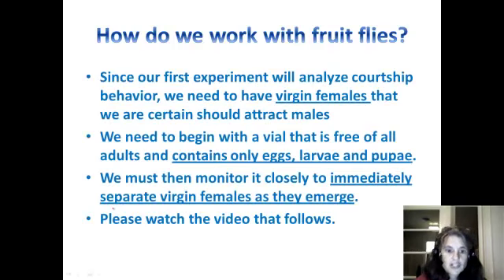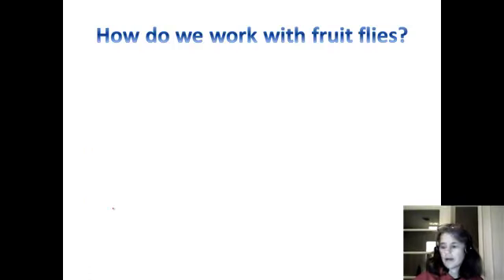Additionally, once you have observed flies for male or female from a culture vial that I give you, we are basically not going to return the adults back into that culture vial, but leave that culture vial so that it contains only the pupa and the larva. And we're going to have to monitor it closely, waiting for the virgin females to emerge, and we'll talk about that as well.